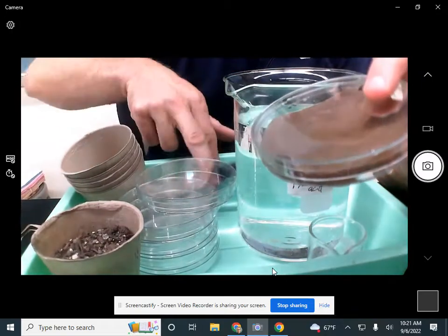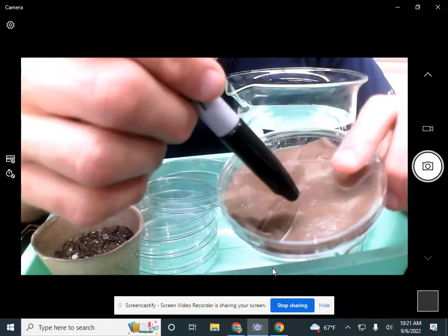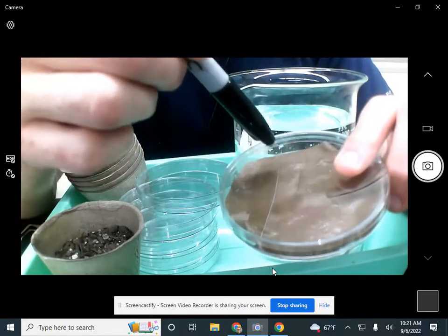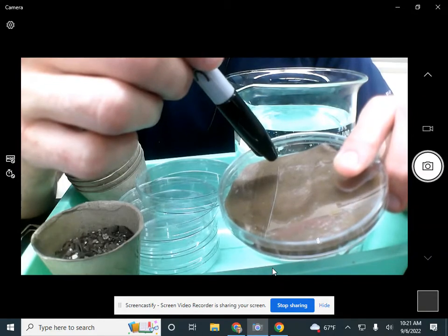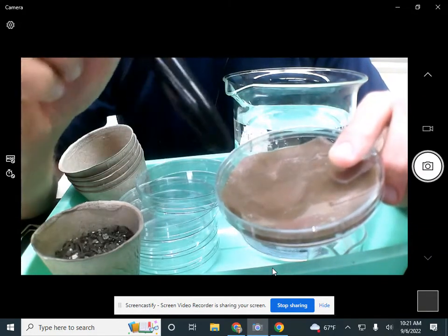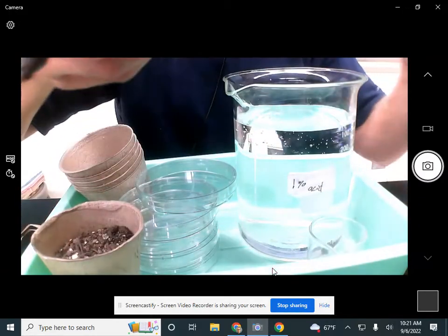Put your lid back on. Now you have a Sharpie. On this, right along the edges or in the middle, I want you to put everybody's initials and I want you to put what mod you're in. That way we know this one's yours. It might be smart if you put the percentage of acid on there too.